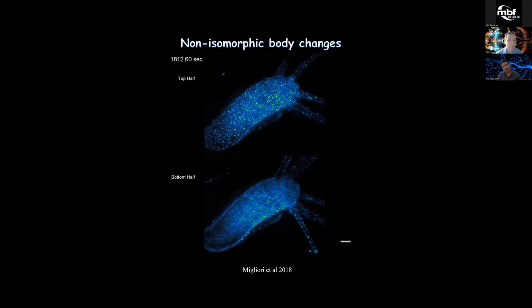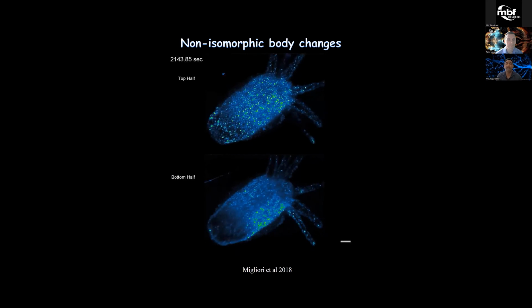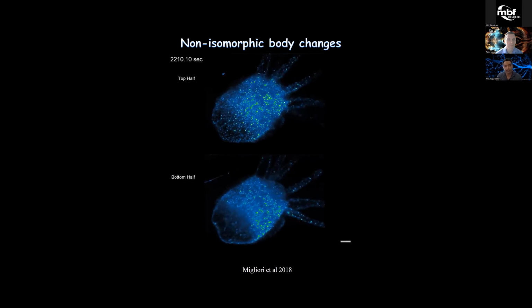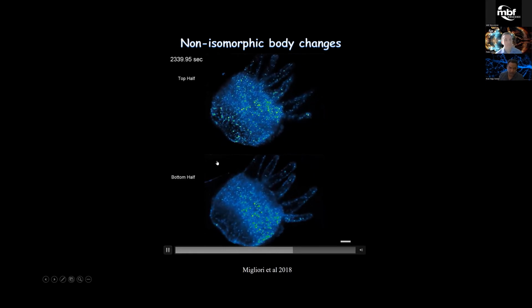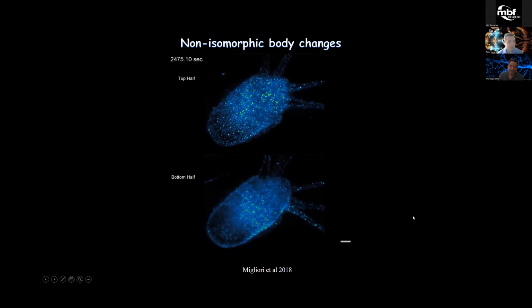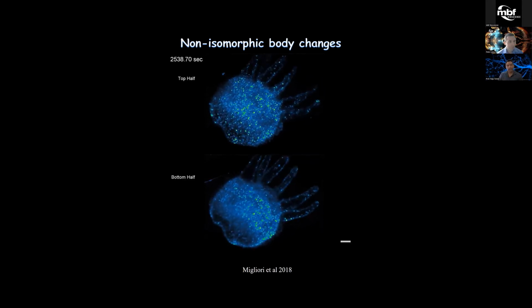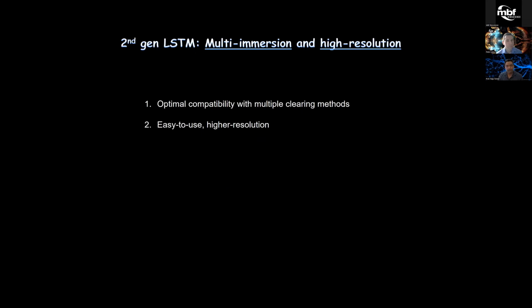Whereas with light sheet theta microscopy, since we are coming only from one axis, the other 2 axes are free for the animal to move or expand into, because that doesn't affect any of the optical properties of the system. Right? So this movie is showing the top half, the bottom half, so you can do this fast volumetric calcium imaging as an example of non-cleared tissue imaging.